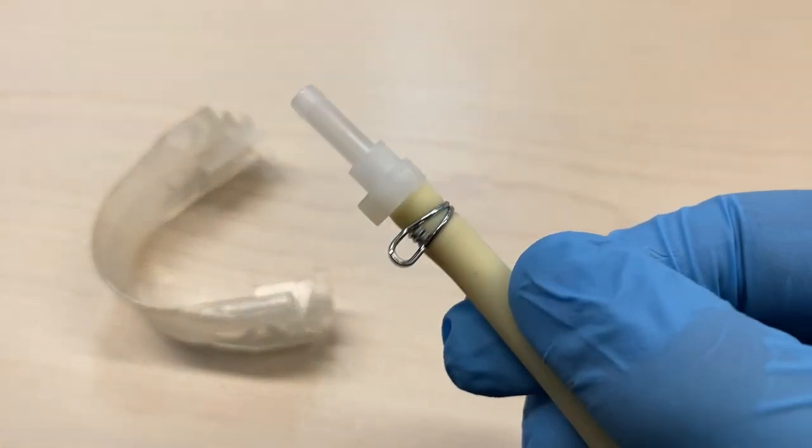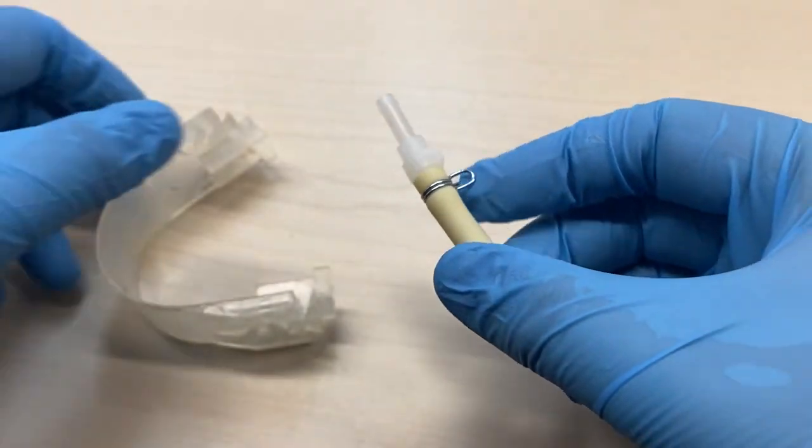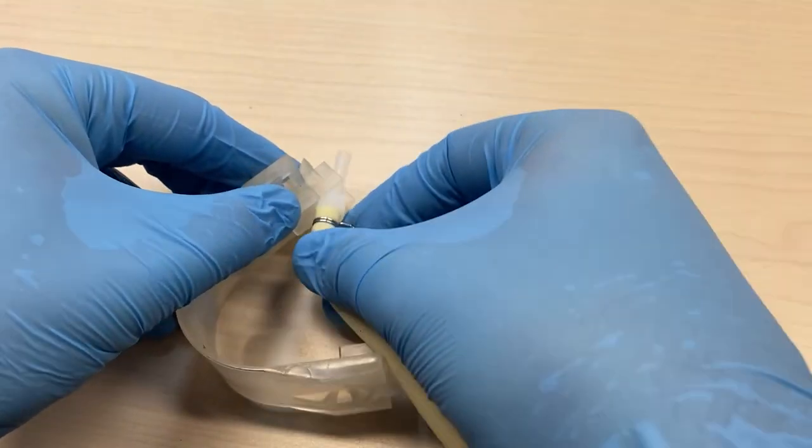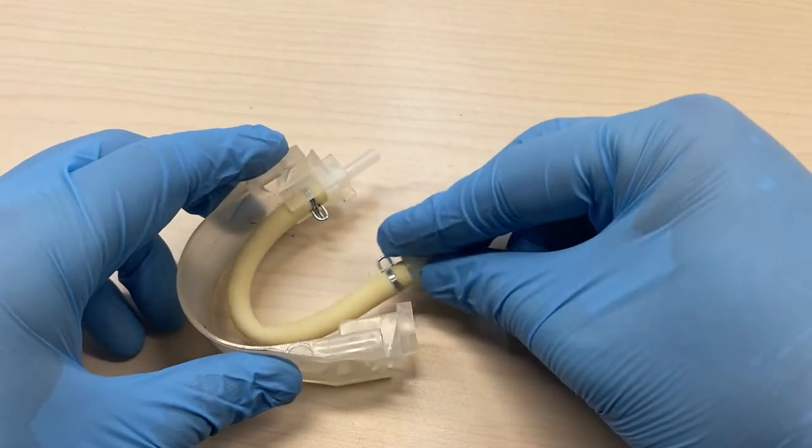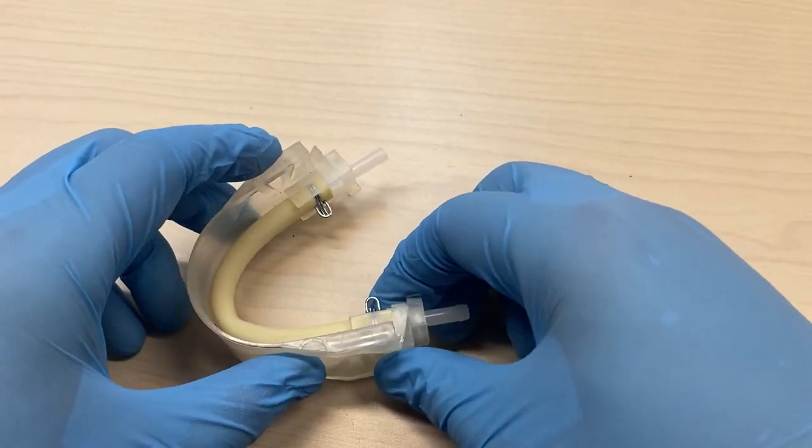Next, when reattaching the plastic cover, be aware the ends of the condensate pump tube are specifically designed to fit in the grooves of the plastic covering.